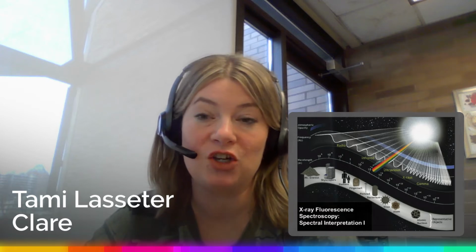I'd like to tell you about XRF spectroscopy. I'm dividing the topic into 3 sections. In this first mini lecture, I'll describe what type of information you can learn from XRF and why spectra appear as they do. By the end of this mini lecture, you'll be able to do basic peak assignments, which is the first step in interpreting an XRF spectrum.